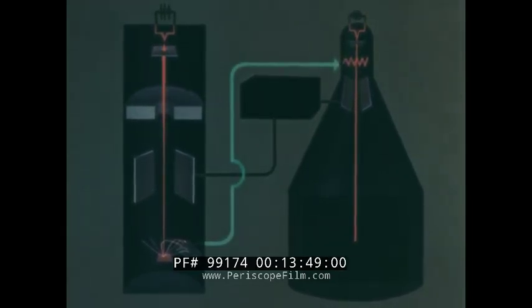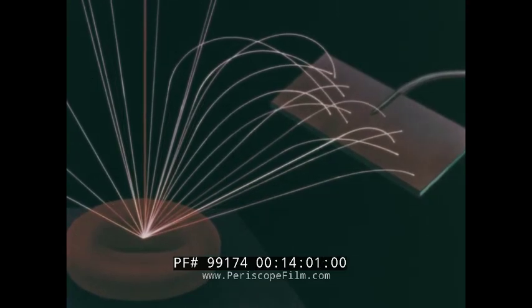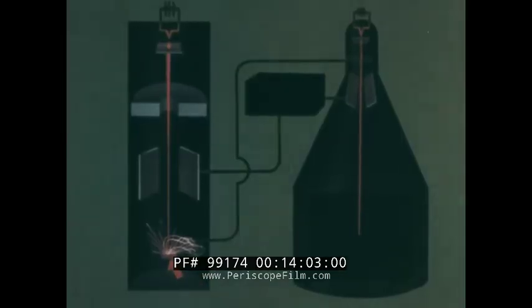The measure of the number of secondary electrons leaving a point on the specimen is used to modulate a second synchronous beam of electrons, which is directed to the face of a cathode ray tube, resulting in a point of visible light. When the induced emission is high from a point on the specimen, the corresponding point on the cathode ray tube display is bright.